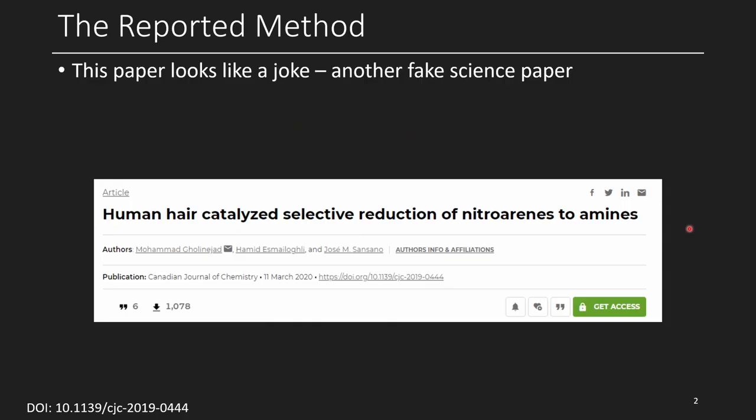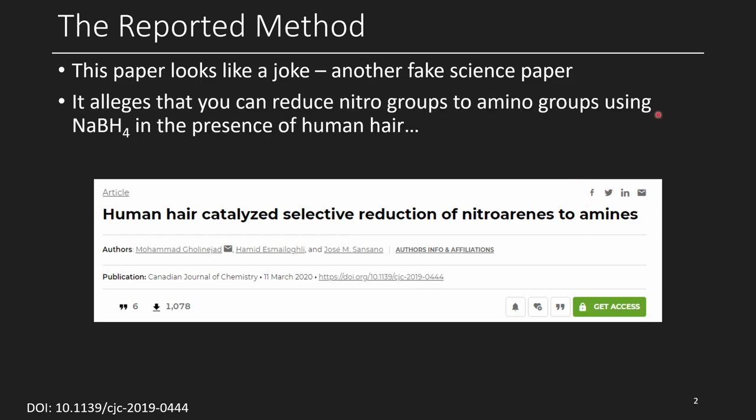The paper we're looking at today was suggested by somebody in the Discord and recommended a few times. This paper claims you can use human hair to catalyze the selective reduction of nitroarenes to amines. Starting with a nitro group, we get an amine. What this paper claims is that you can reduce nitro groups to amino groups using sodium borohydride with human hair as a catalyst, although the catalyst loading is fairly high.